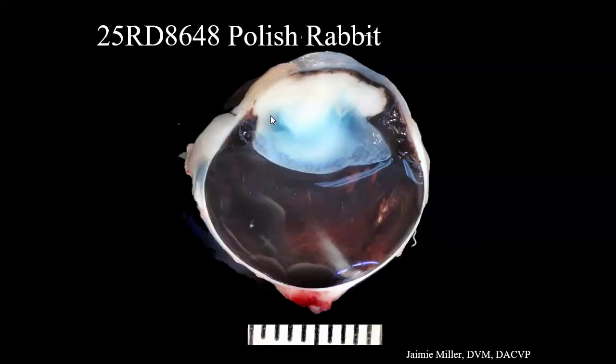Our lens is a little bit cloudy, and then you can see this white opaque material that seems to be extending from the anterior surface of the lens and filling this portion of the globe. The rest of the eye wasn't too terribly interesting grossly, so let's look at this histologically.